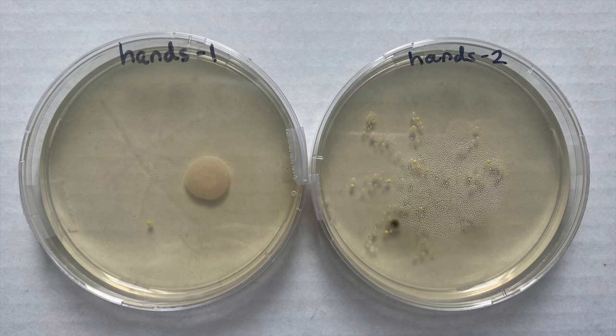In a future experiment, it might be interesting to plate dirty hands, wash them, and then look at different methods of drying to see if there are cleaner versus dirtier methods — perhaps blowing them dry with your mouth, using a paper towel, or using a cloth towel.